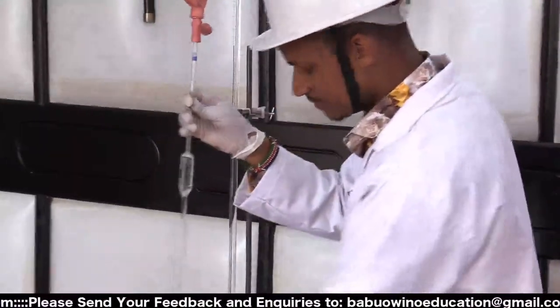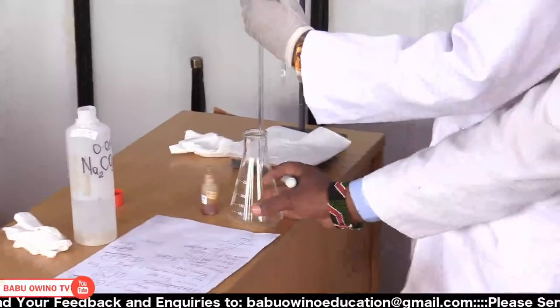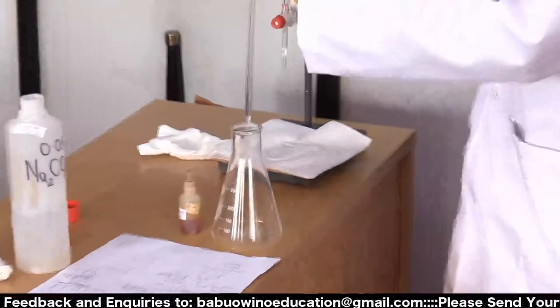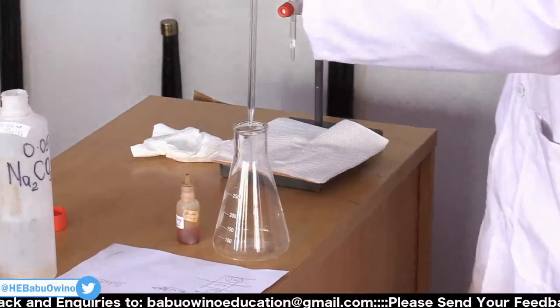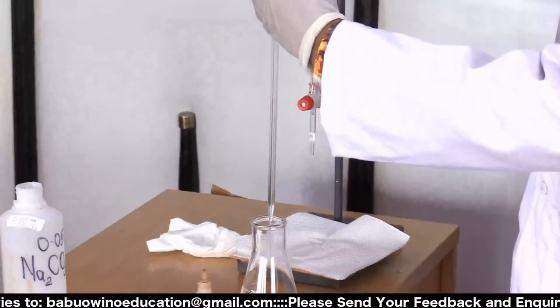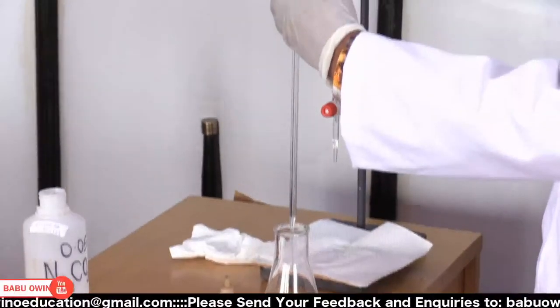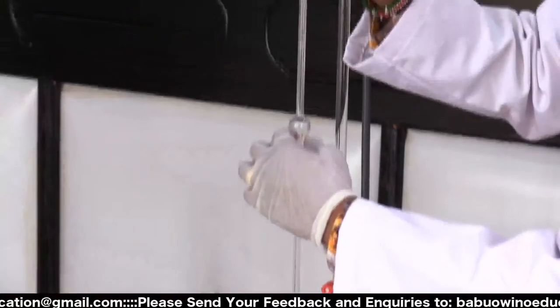Then after that, in a clean conical flask, you release. So you just press it. You release it inside the conical flask. Then note that we'll be adding an indicator.